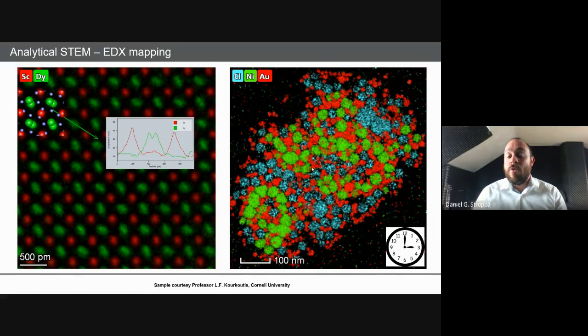Good. Any other question at the moment, or may I share something just? Oh, I have a small question. Why, when we start to use TEM, is the technician asking if this material is magnetic material?